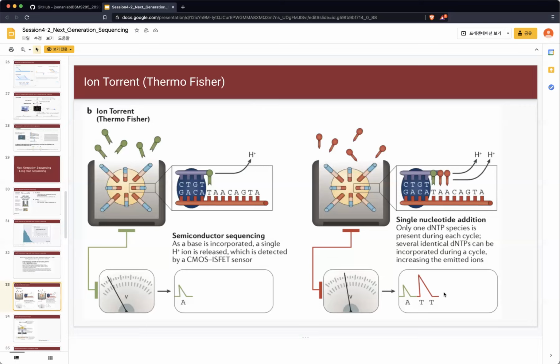They open up their scripts and algorithm principles and people discuss. But Ion Torrent, in my opinion, failed in that sense. They're very closed, and they provide their algorithms only through the company. Without a commercial license from the company, we cannot adjust their analytic framework. So that is one reason why people do not choose Ion Torrent for development, right?